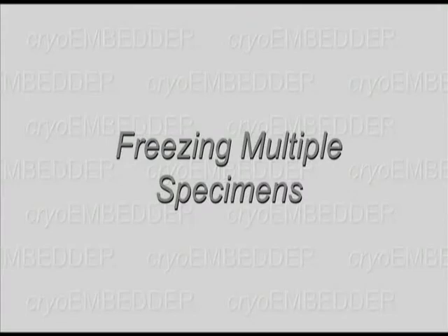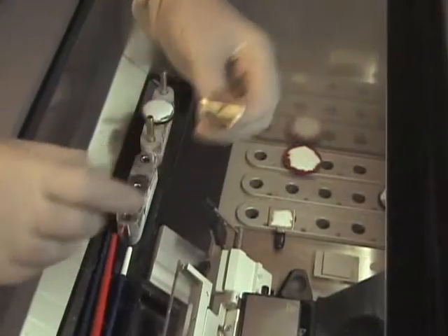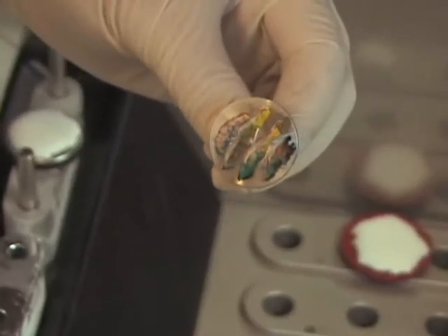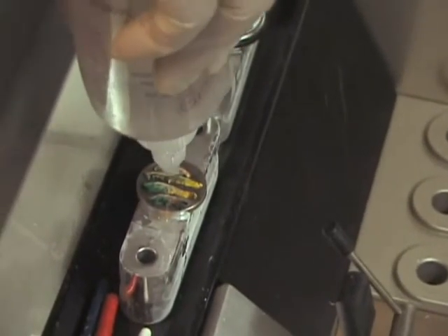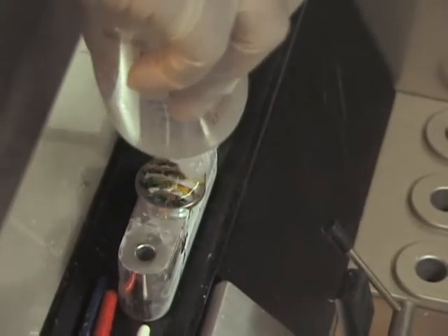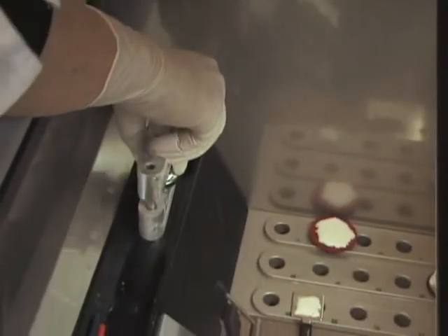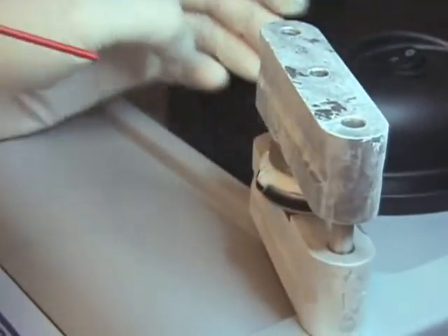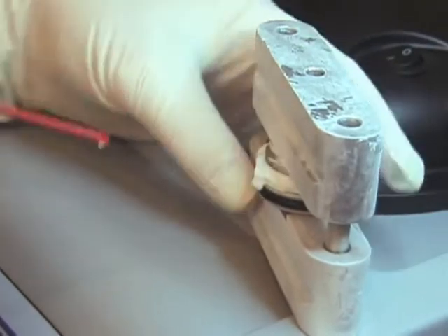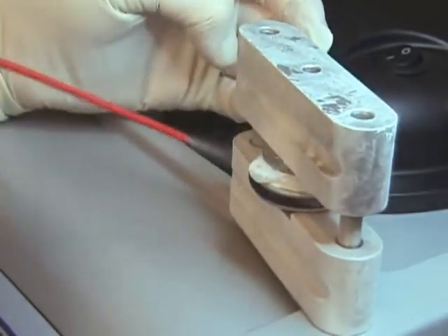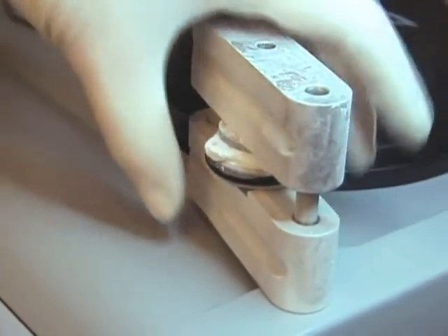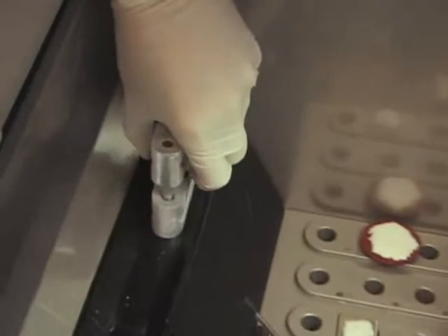Second stages or levels can be time-consuming to embed and cut due to multiple pieces. If specimens are mapped and dyed using different colors for each piece, there is no reason they can't be embedded on the same disc. This greatly speeds up the processing turnaround time. All four pieces are marked differently, one from another, and all are embedded on the same flat plane. They will all be cut together and placed on the slide together. This will give the doctor fewer slides to view, there will be fewer slides to stain, cover slip and file, but most importantly, the patient will have a shorter wait.